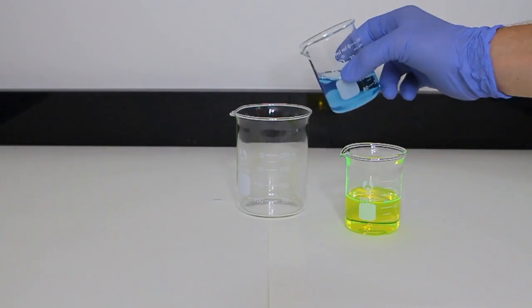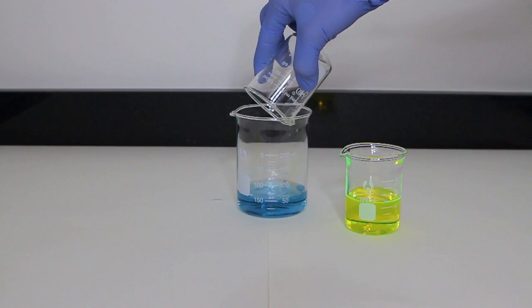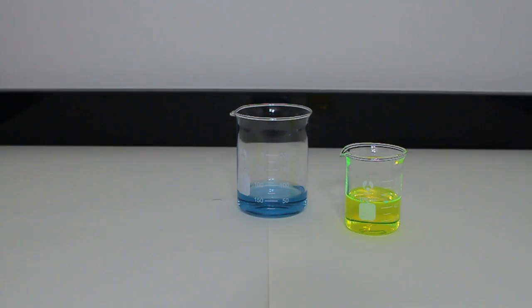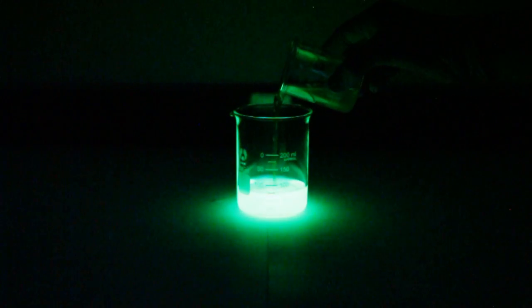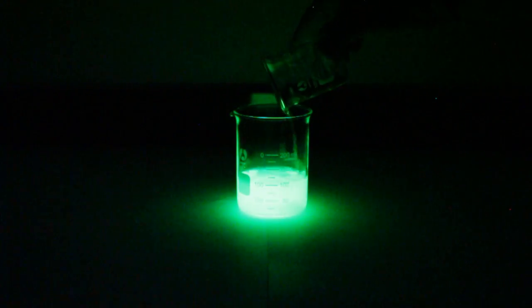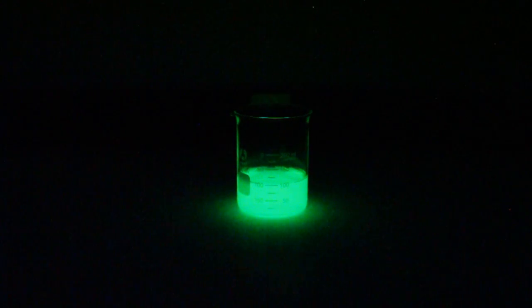With the two solutions ready, it was time to see if different colors were possible. I pour the blue solution containing the luminol into the clean 200 milliliter beaker and turn out the lights. When the fluorescein and hydrogen peroxide solution is poured in, a bright green glow is produced. Multiple colors are definitely possible. This light is even brighter than normal, likely due to the fluorescein amplifying the light because of its optical properties.